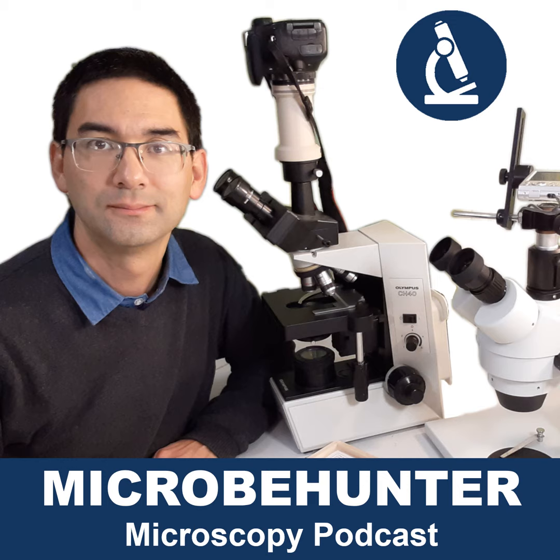If you want to go out and observe water samples and water specimens, of course you can look at them also under stereo microscopes, but some of the smaller organisms, I would say, are more interesting to observe under higher magnification. And another reason why compound microscopes might be an advantage is because you can also buy ready-made slides to look at. Okay. So this means you simply buy yourself ready-made slides and you simply put them under the compound microscope and you look at them, and then you don't have to do any specimen preparation. Okay, so that's basically if you cannot decide.